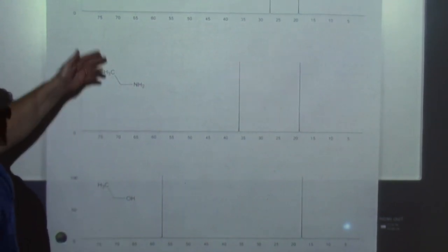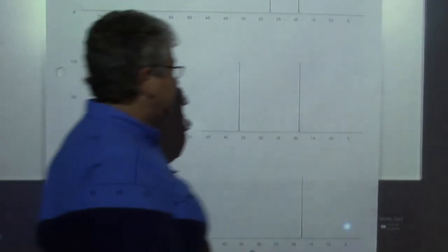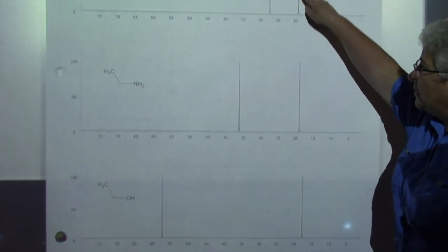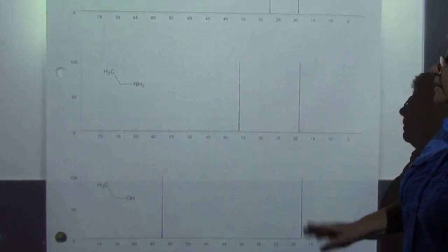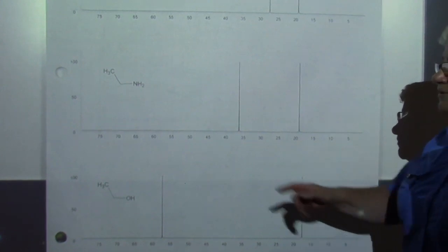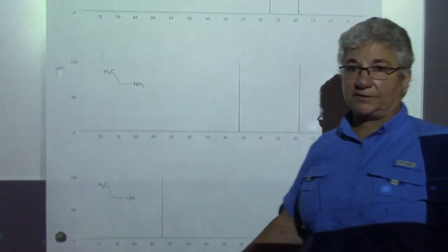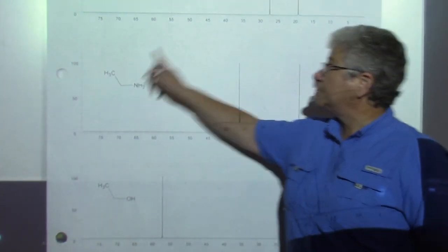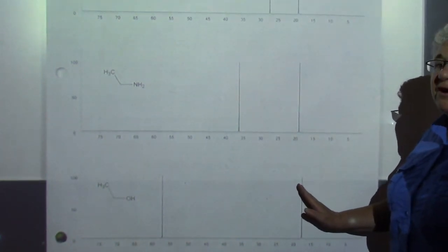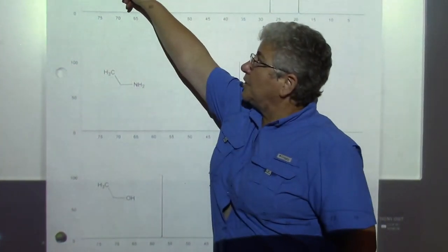And the CH3 group that is furthest away from the heteroatom really doesn't change its position very much. It's all in a row. And so we would call that an alkane-like carbon. It's pretty far upfield. It only has hydrogen and carbon single bonds. So this carbon right here is the one that is showing up and not really changing its position very much. But the carbon that is changing its position is the CH2 carbon.